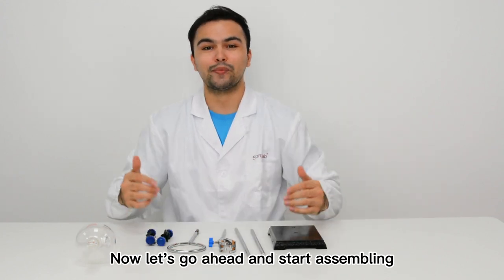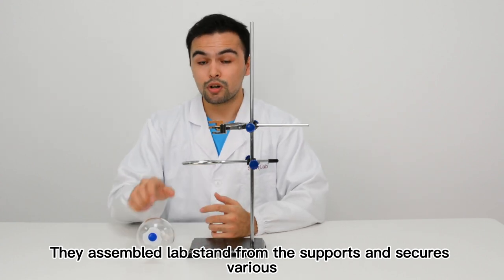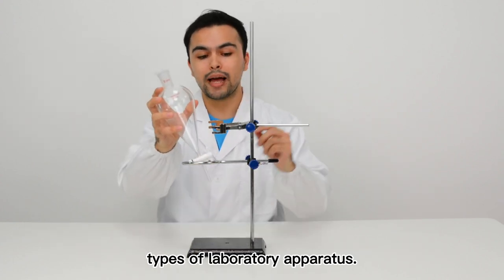Now let's go ahead and start assembling. The assembled lab stand firmly supports and secures various types of laboratory apparatus.